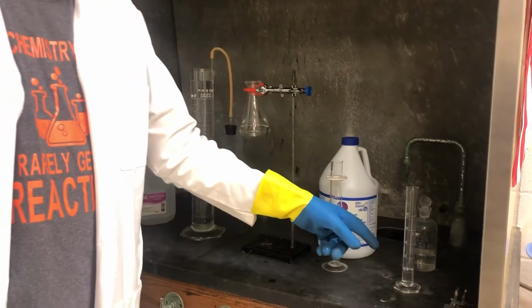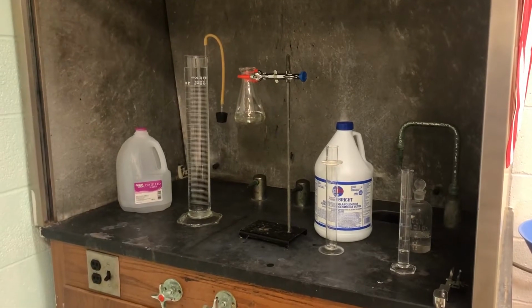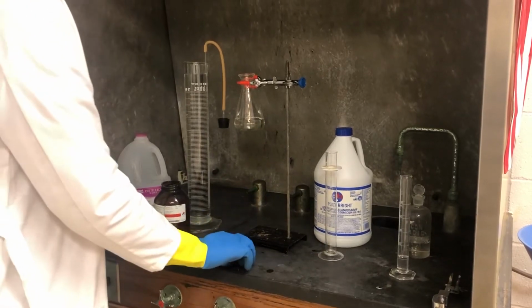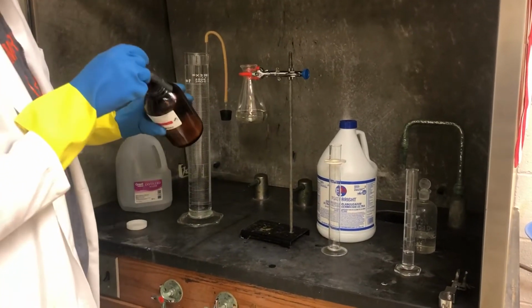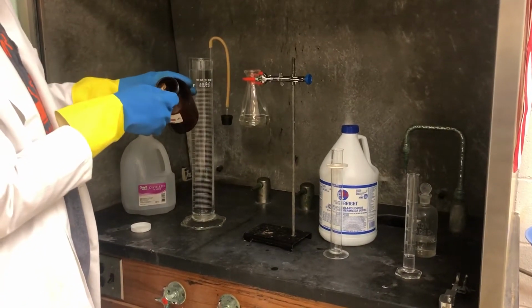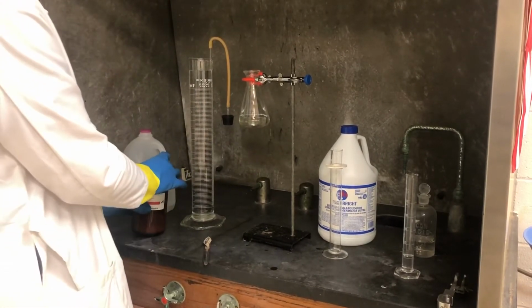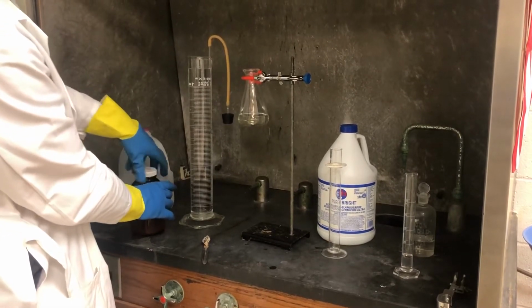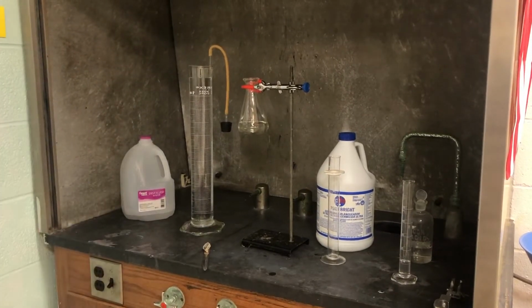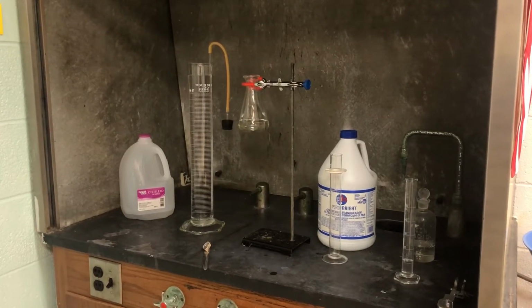Now I'm not going to add the acid next. Well, I am, but I'm going to go ahead and get my pebbles of calcium carbide ready. Don't need a huge piece, but one nice size would be good. I think that would be more than adequate. I don't want this to be something to inhale, because just the dust from that reacts in your lungs to make the ethyne, and so we don't want that to occur.